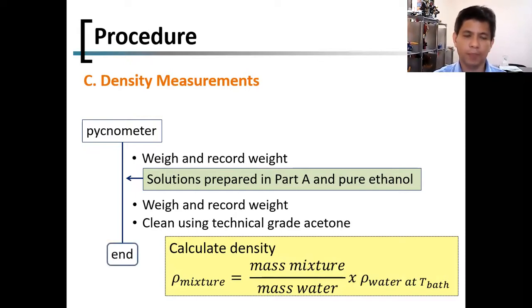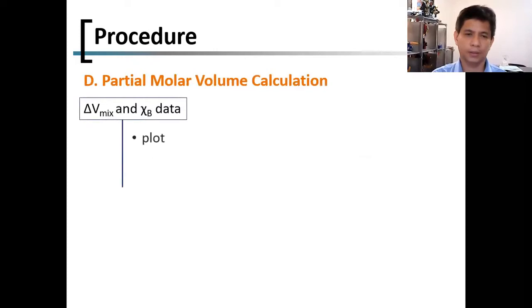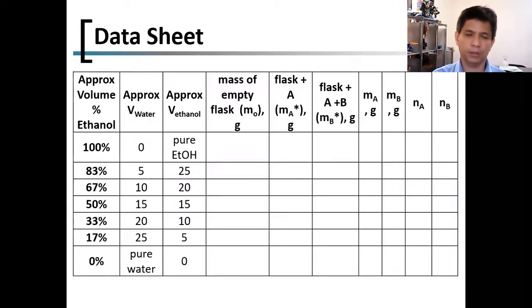Okay, so that's the end of the second part. Dito kasi letter C, so iniwalay talaga yung water. Pero basically yung part B parehas din lang naman ng procedure nitong part C. Hindi ko lang alam ba't iniwalay pa nila yung water. Pero it's basically the same. Gumagamit din naman ng acetone after each run. So let's try to see the calculation.